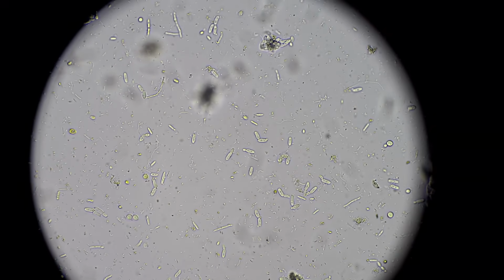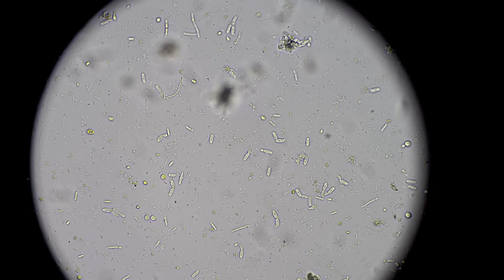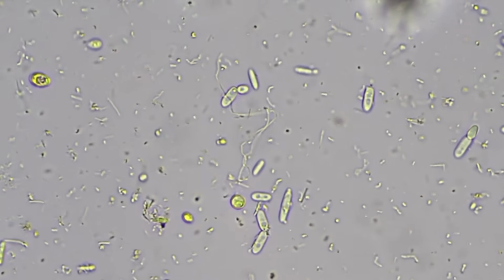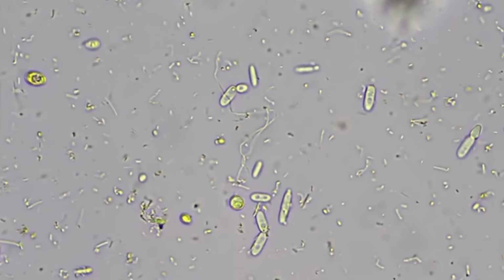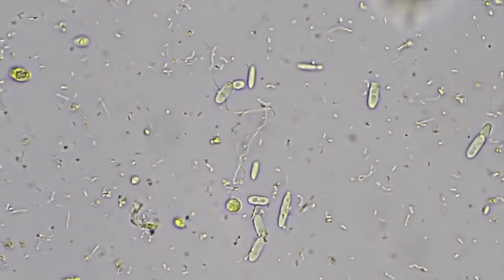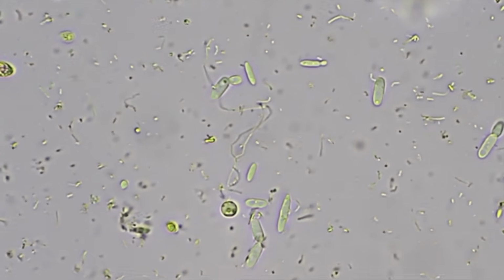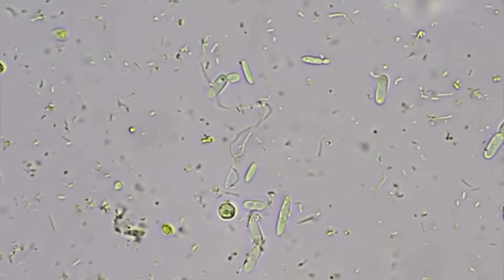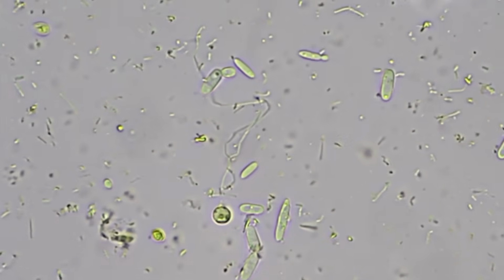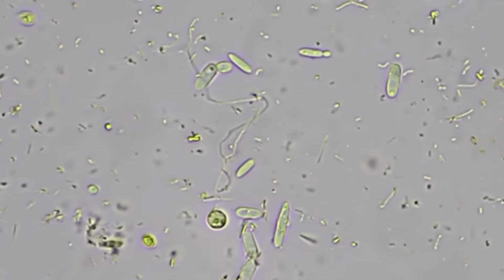But see how this is squiggly right here? This is not, see this right here? Just look at the center and then look to the left. This right here is not lactobacillus at all. This is actinobacteria. See how it's all squiggly? And it's likely streptomyces. There's a strong, beautiful rod right there. And then right above it is a yeast forming another yeast, budding off.